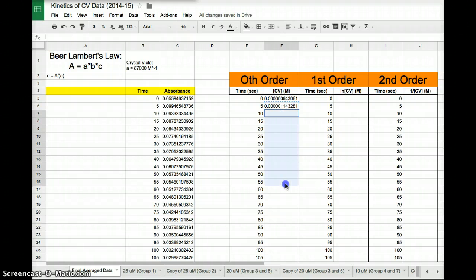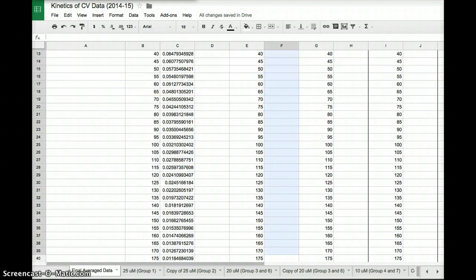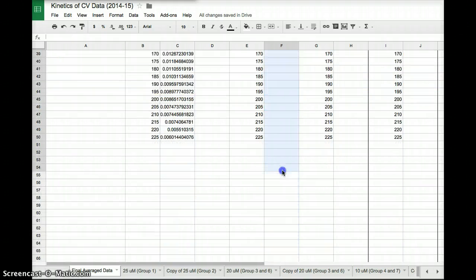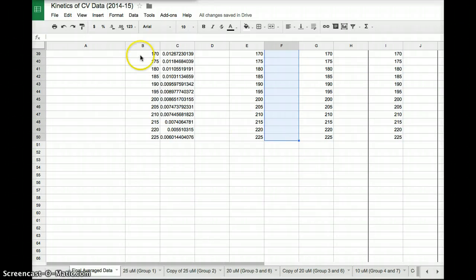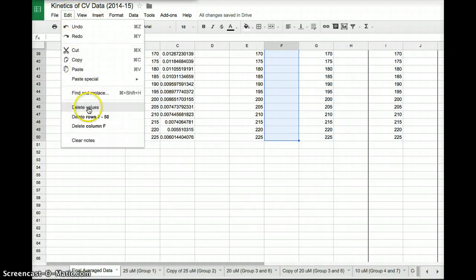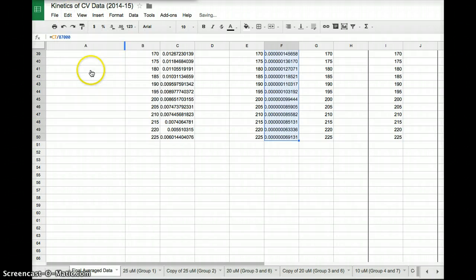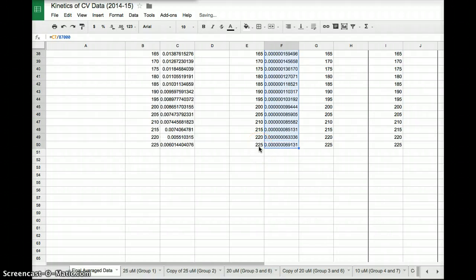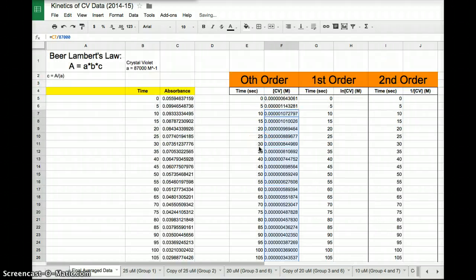Now what the computer's done is it's copied that function. Now I'm going to highlight all of the other cells that I want to fill the numbers in for. So all the way down to 225 seconds. Now I'm going to go edit, paste. Ooh, cool.